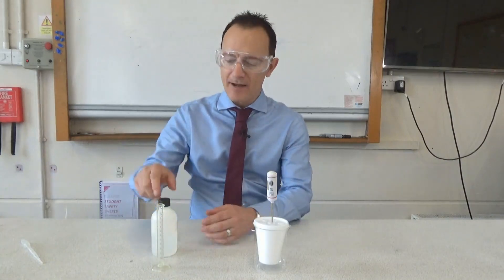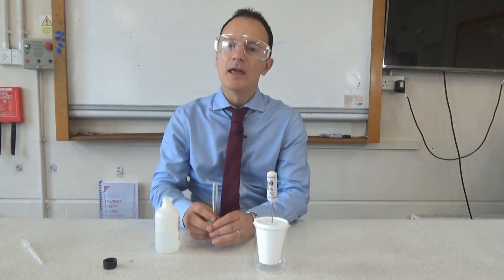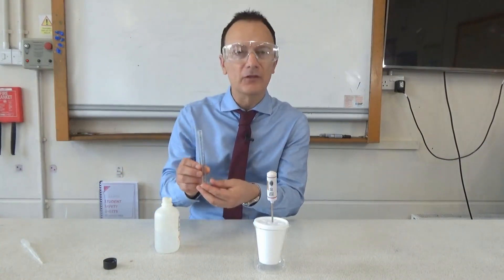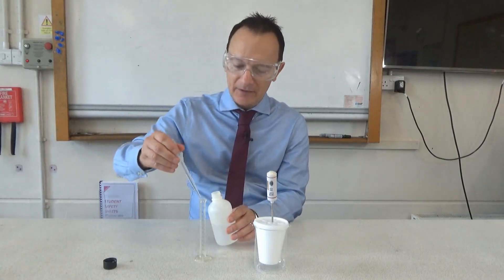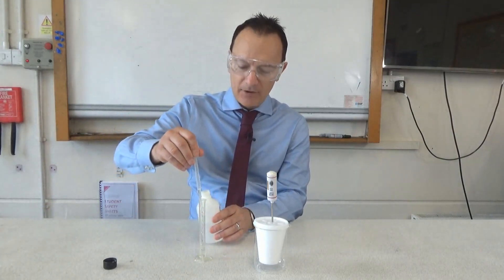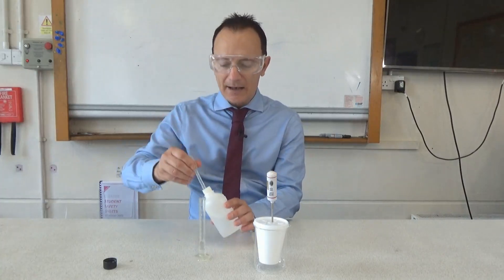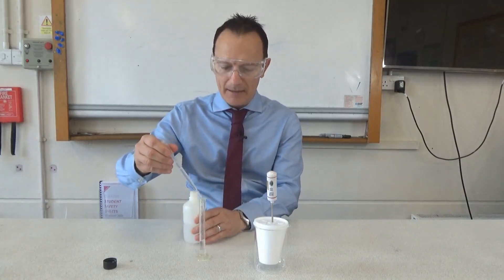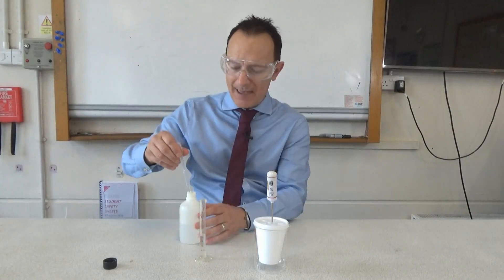Then measure out 5 cm³ of sodium hydroxide solution — I'm using a smaller measuring cylinder because it's a smaller amount. If using the same measuring cylinder as the acid, make sure to rinse it out between each chemical. You'll notice I'm also using a pipette, as many people find it easier to be more accurate with measurements when adding with a pipette.